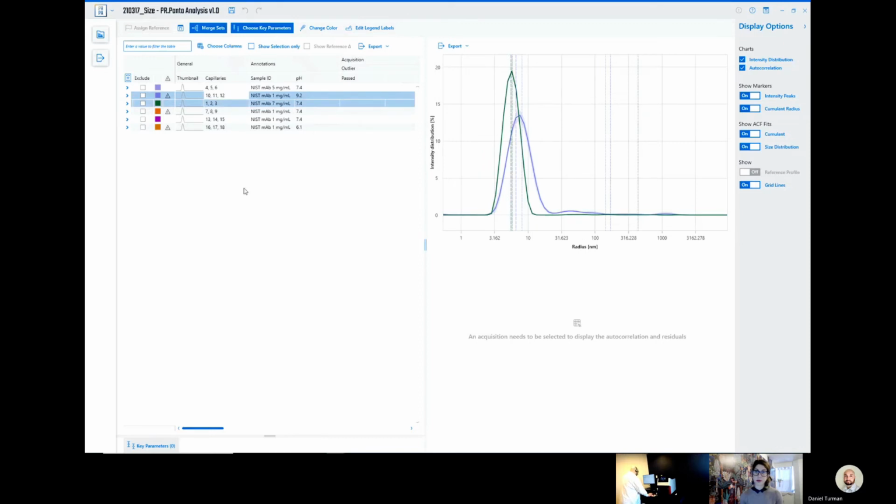So if you were a formulations chemist, you would think deeply about why that's occurring and how you can improve your formulations. If you're a structural biologist, you could use this information about formation of perhaps a long sought after protein complex that you haven't been able to find, and now you found the condition in which it stabilizes it, etc.